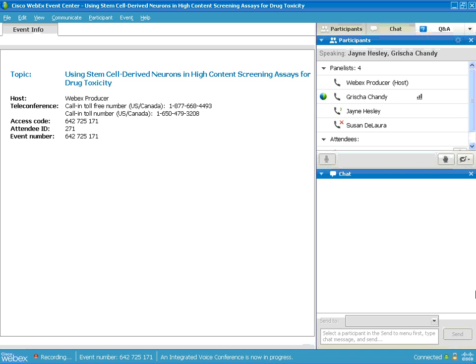We used Hoechst for nuclear stain. We've used several different Alexa Fluor secondary antibodies, 546, 647, 488. We've used calcein AM and the JC-10 reagent. We've used MitoTracker Red.